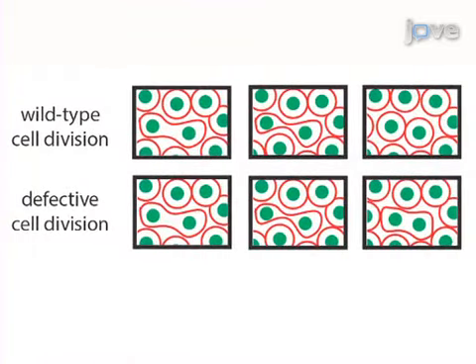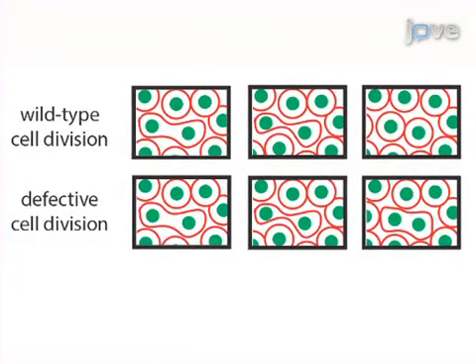The results will show how neuroblasts divide during C. elegans embryogenesis, and the role of genes required for their division.